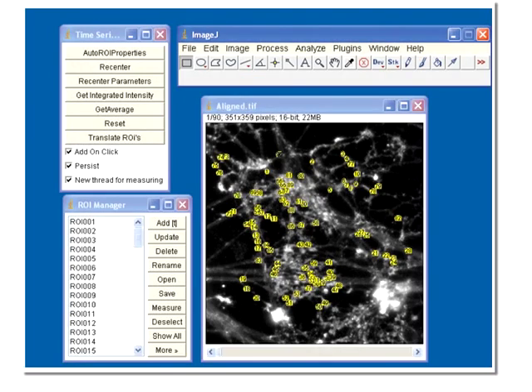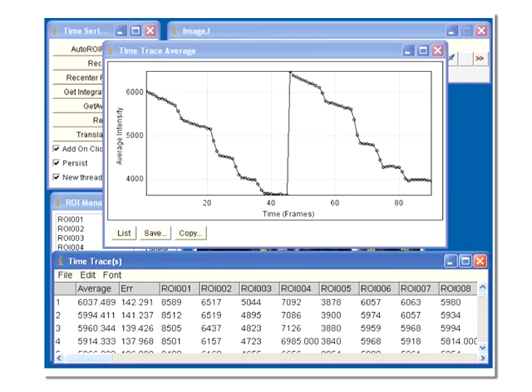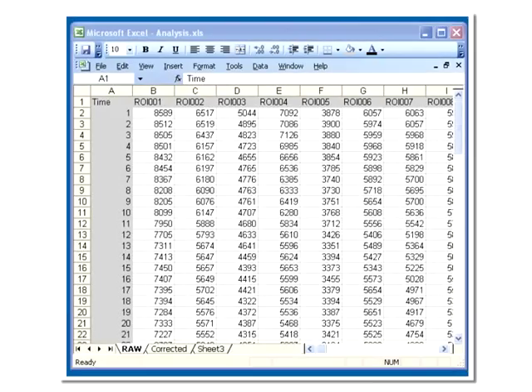Next, define the regions of interest over at least 90 nerve terminals. It is helpful to toggle between the images before and after dye unloading to reveal active nerve terminals. An ideal region of interest size is one that is slightly bigger than a typical nerve terminal. Then obtain the total fluorescence intensity of each region of interest over time. After that, export to Microsoft Excel.